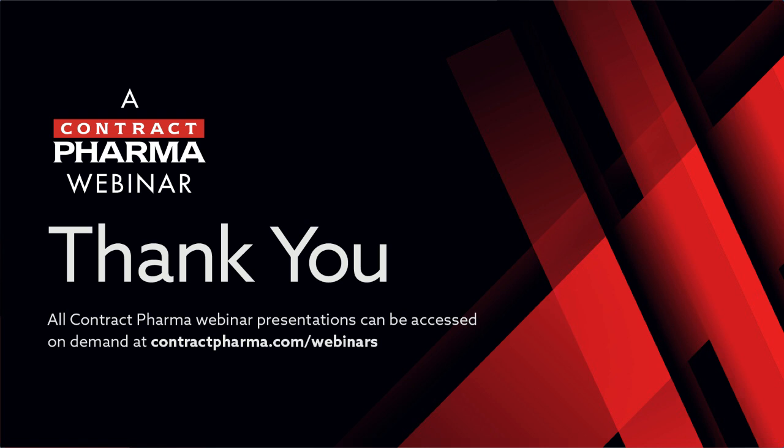Okay, so these container closure integrity tests are not really dependent on what's inside. The deterministic ones are just dependent on the closure being good. And so you could fill them for your validation.